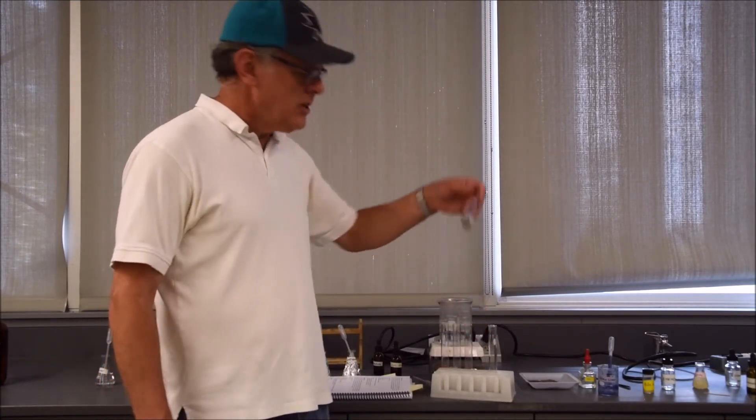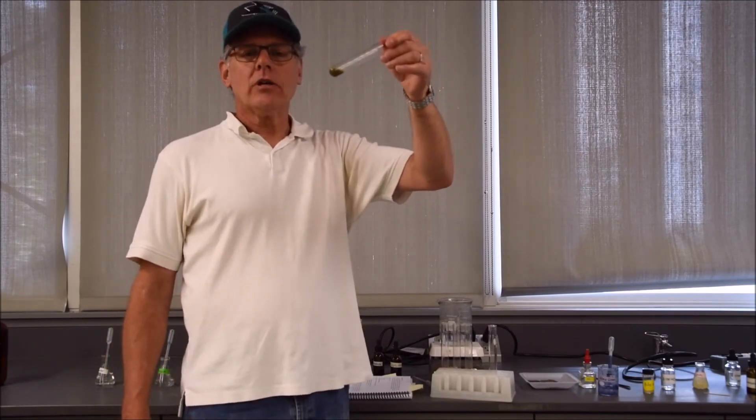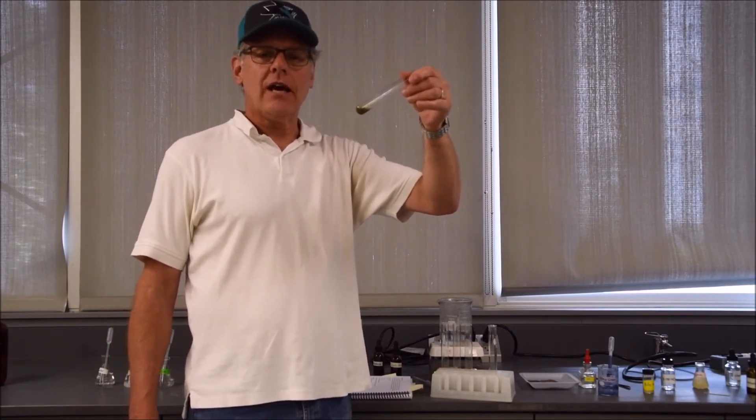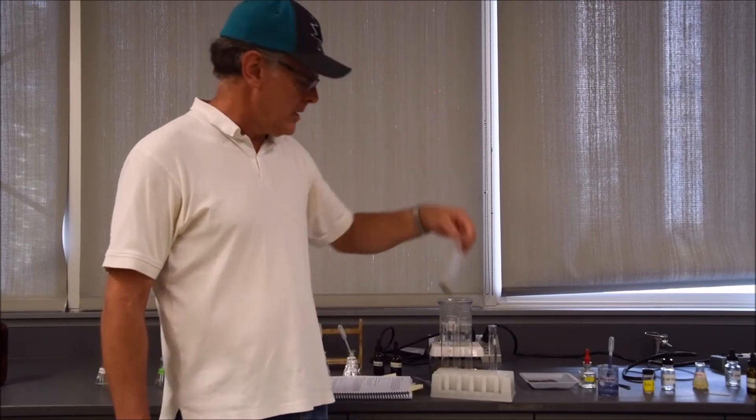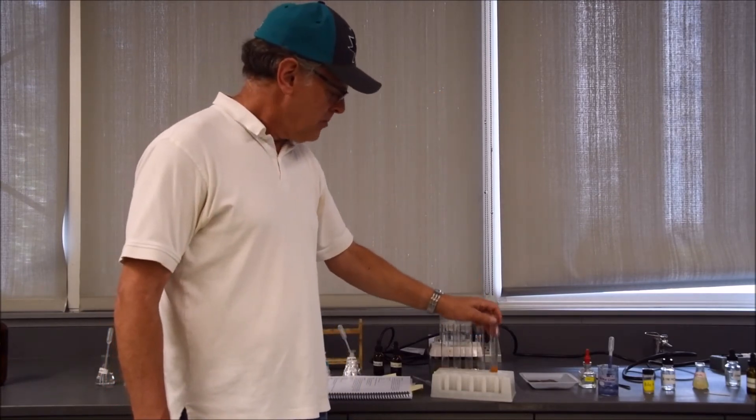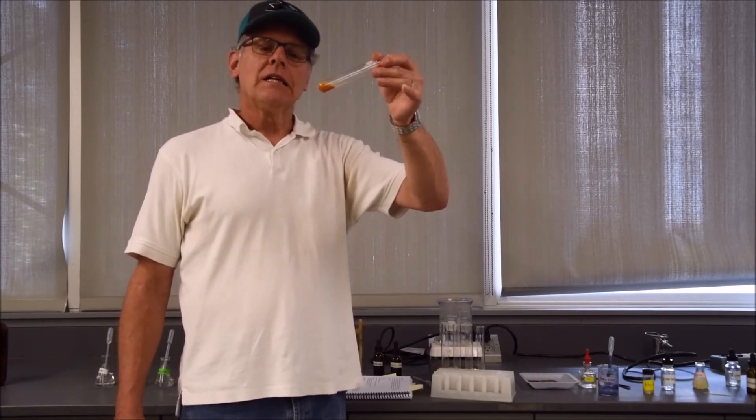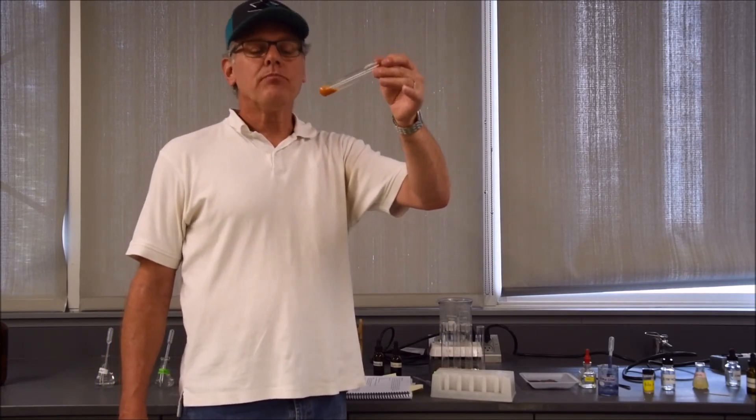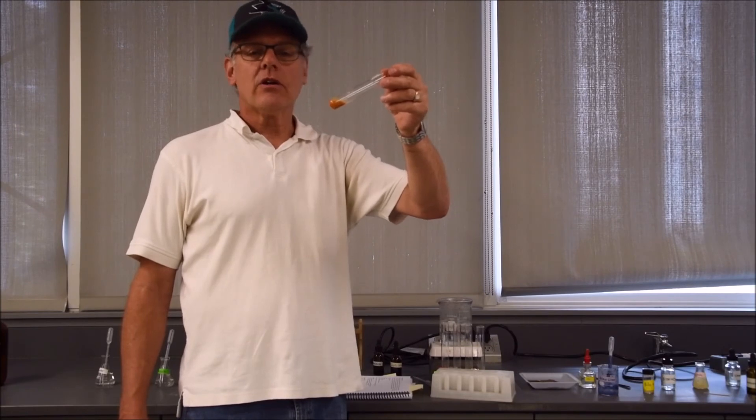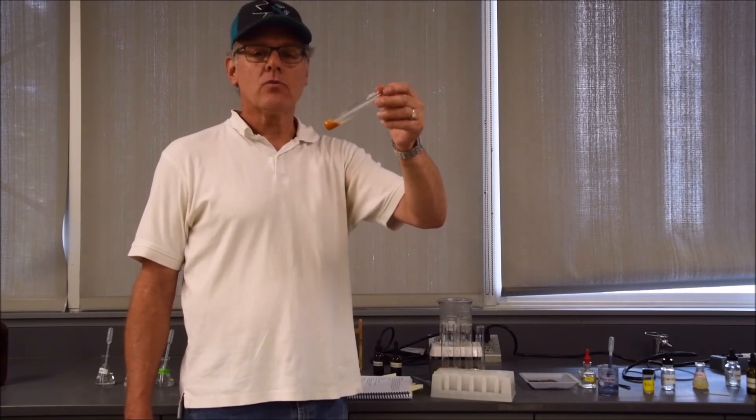Tube number four is onion juice, and this one also changed pretty dark, telling us that onion juice has a fair amount of monosaccharides present. Tube number five was a potato slice. There's a little bit of color change here, actually pretty decent, telling us that monosaccharides are present within potatoes as well.